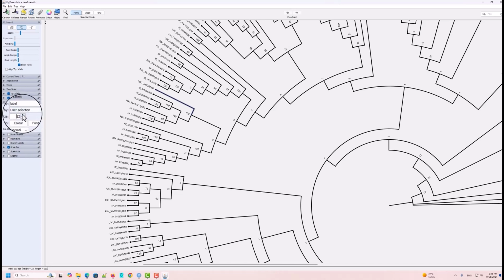Okay, and now you can come here and click the node shape, this shape at the end of the branch. Here you can change it to rectangular, you can change it to diamond shape, but if the tree is a congested tree, then you don't need to change it. Okay, so here we will keep it like this, and you can uncheck this as well.